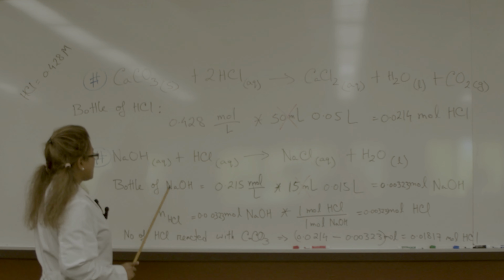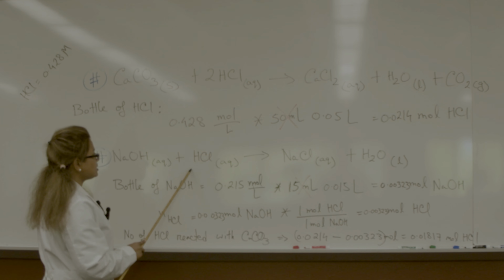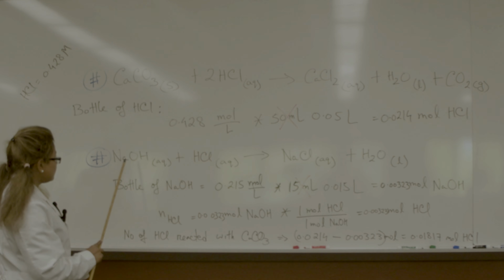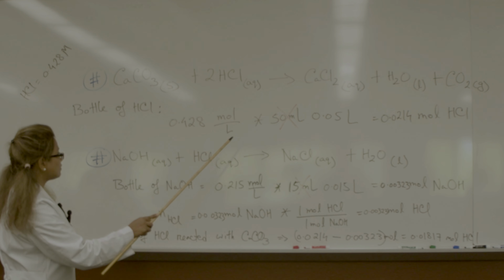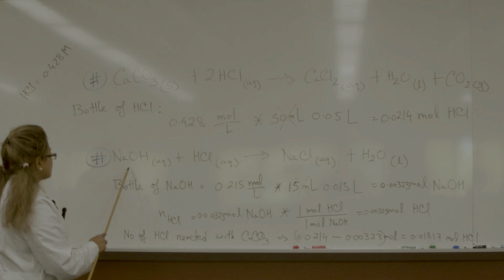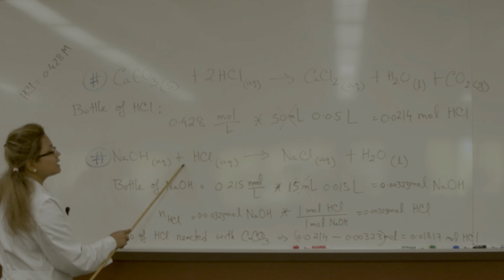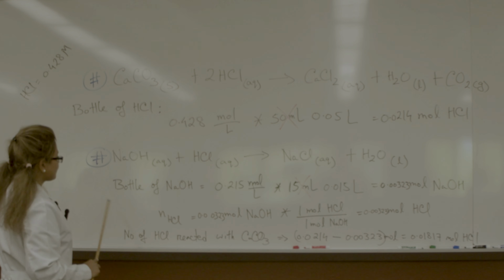Now, this is a stoichiometry reaction and it's my balanced reaction. Same mole that I used, same mole of the compound I end up with. So you can see that there is no number, right? So one is hidden. That means my reaction is a 1-to-1 ratio.